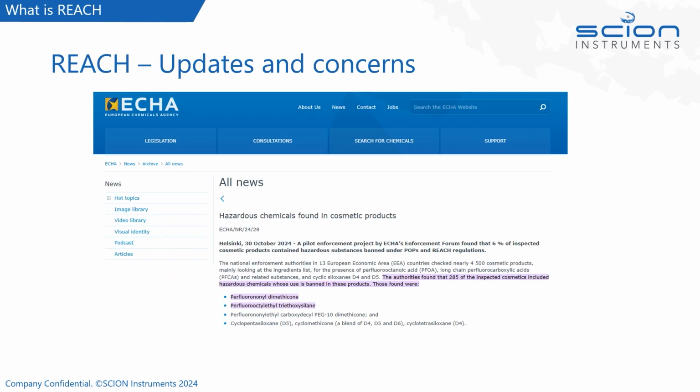So this is just a quick slide that I've thrown in to highlight the real importance of REACH and of this testing. This is an article taken from the ECHA website, referring to hazardous chemicals found in cosmetic products. In 2024, 4,500 cosmetic products were tested, and 285 of these were found to contain chemicals, the use of which is banned in these products. So roughly 6.3% of the products tested were found to have hazardous chemicals that are banned. It really does highlight the importance of REACH testing and of this regulation.